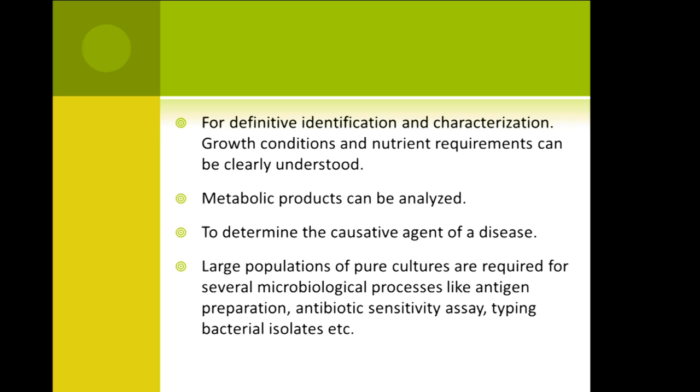For that purpose also, the sample taken from the patient is analyzed and used for pure culture techniques. Again, large populations of pure cultures are required for several microbiological processes like antigen preparation, antibiotic sensitivity assay, typing bacterial isolates, etc.